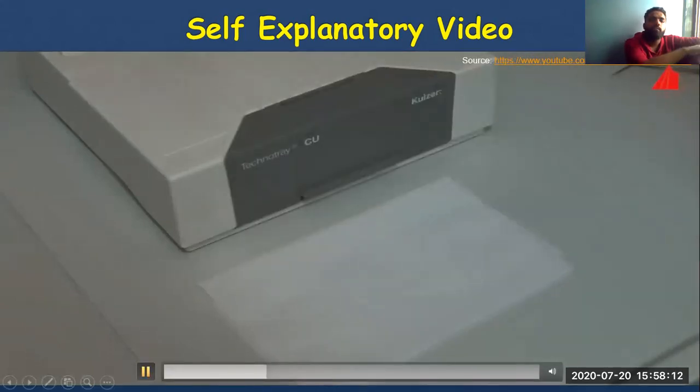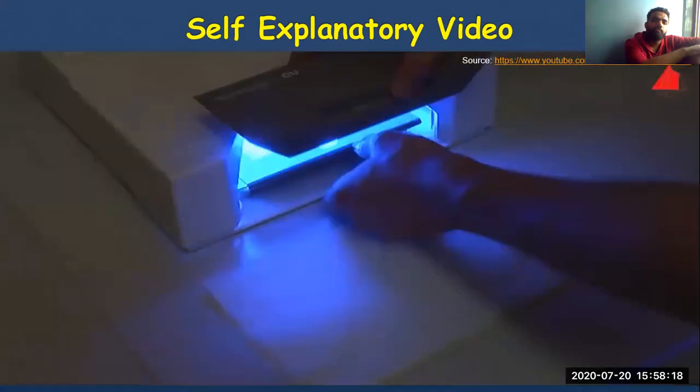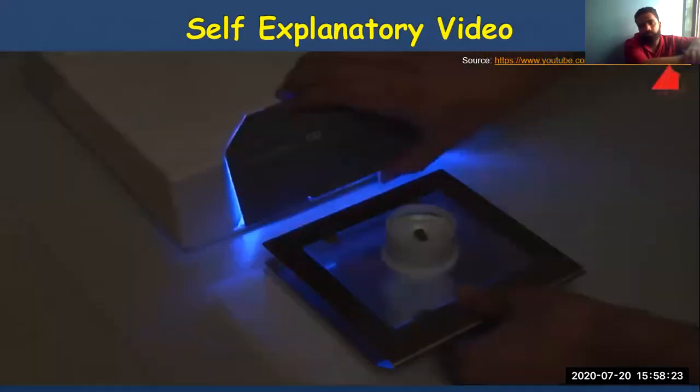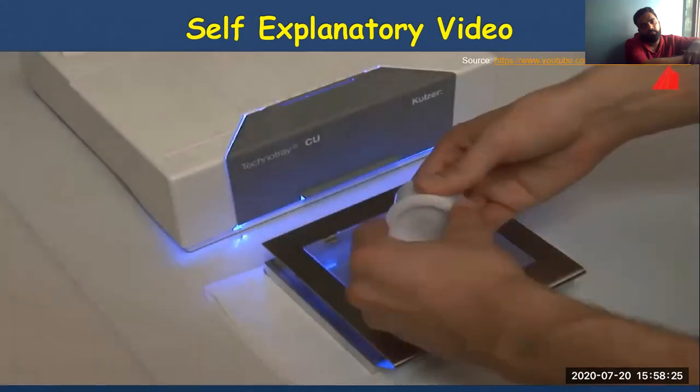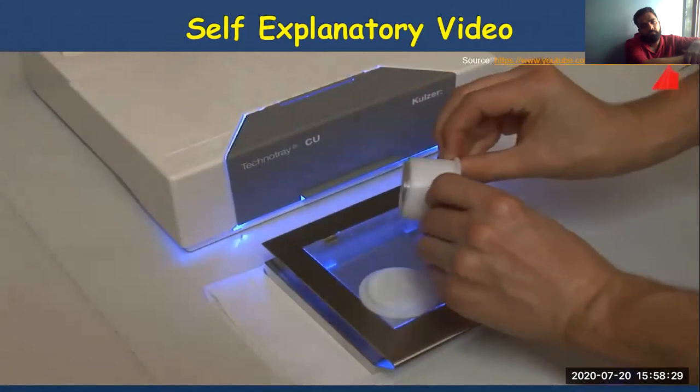Under the action of intense blue light, the resin polymerizes within half an hour. The resin has cured and embedded the specimen well. As an alternative to light curing resins, many other embedding materials are available. Each of them has its own advantages and disadvantages.